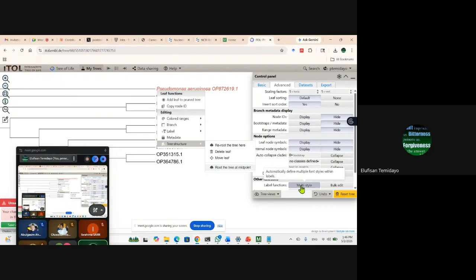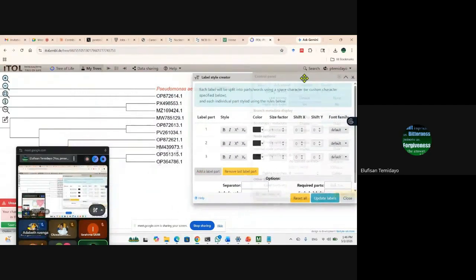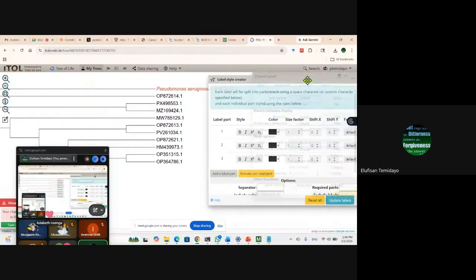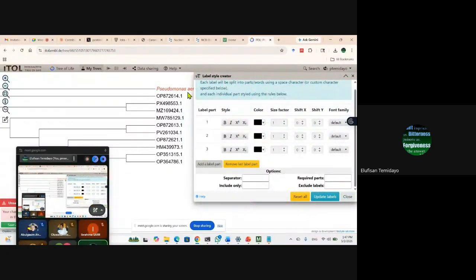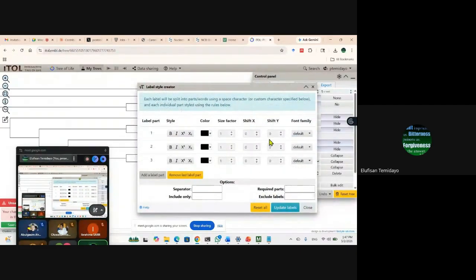Hello, are you with me? Okay, thank you. So from my multi-style, I can now change them. So the last style is, which one is that guy? So I have, let me check now. I have three levels. This is 1, 2, 3, and the third one. So this is the third one that I don't want to be italicized. I want to straighten it. So let's see if it's done that for me. It should do that for me.